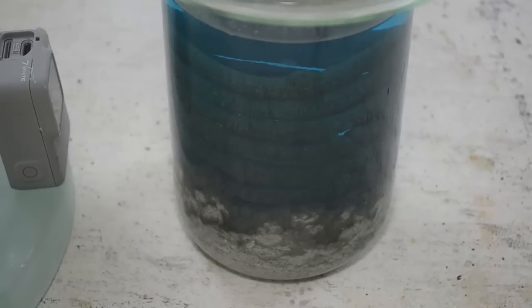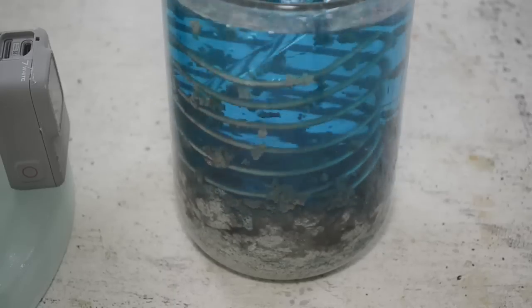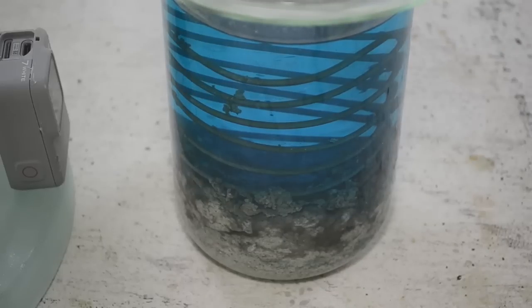So here we are, not quite 1 hour in, and the coils are completely covered with a thick layer of cement silver again. Now, interestingly, the color of the silver has changed dramatically. It's gone from very light to very dark. Now, I can only assume that is a result of a difference in the size of the crystals in there, not due to any kind of contaminant, I'm thinking. I'm thinking these are just smaller crystals and they're not reflecting the light as efficiently as the bigger ones did. I'm going to shake the coil and expose some fresh copper and leave it going.